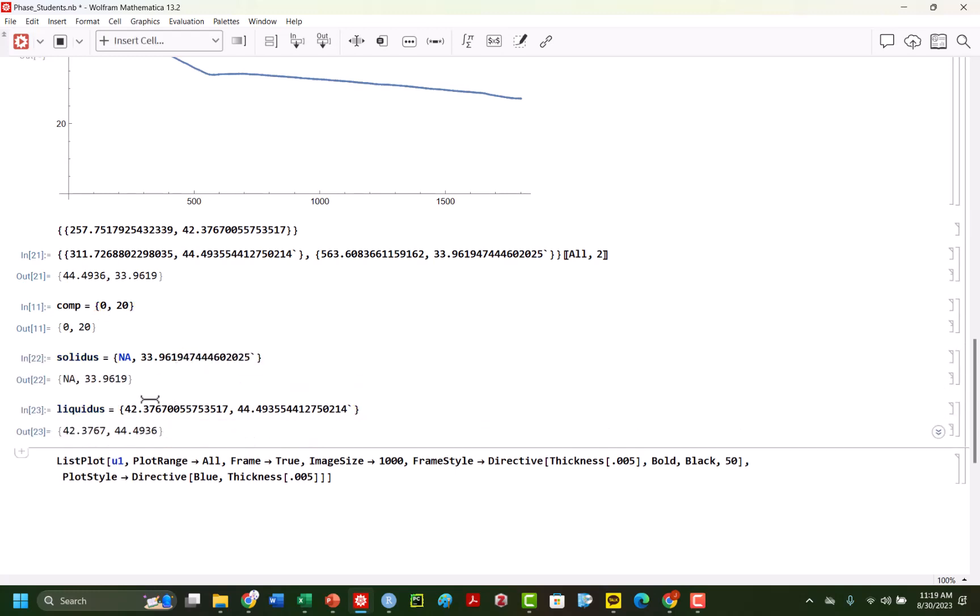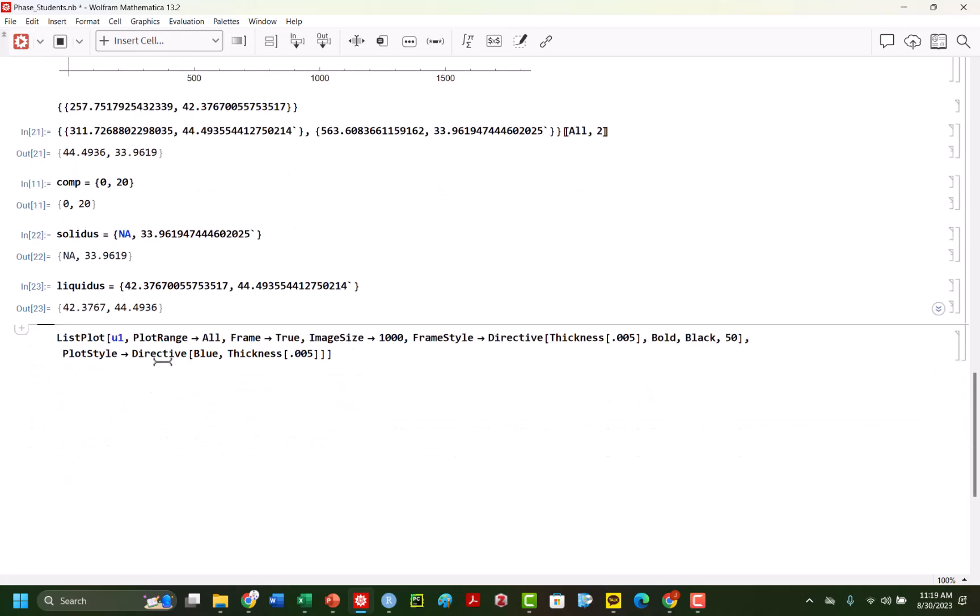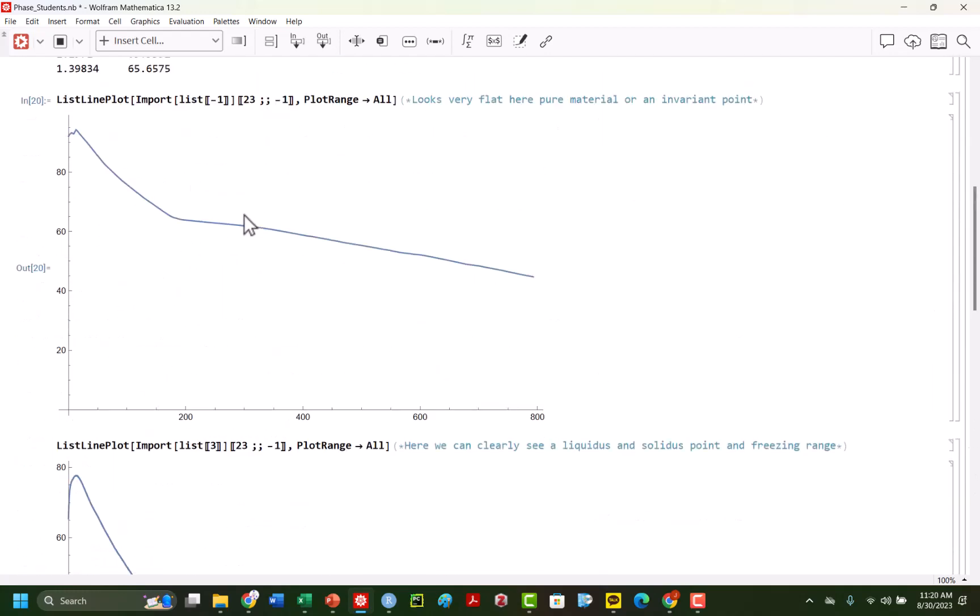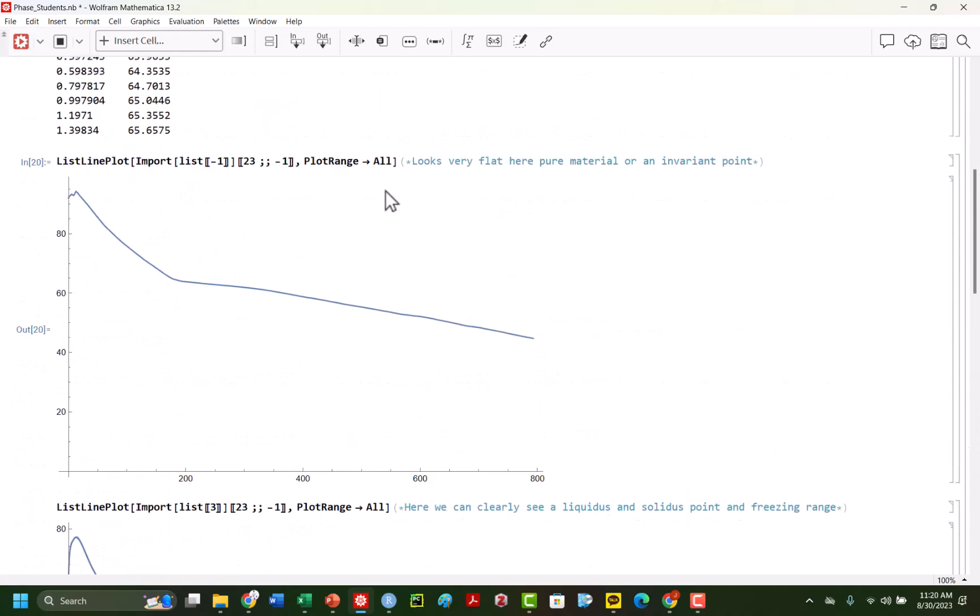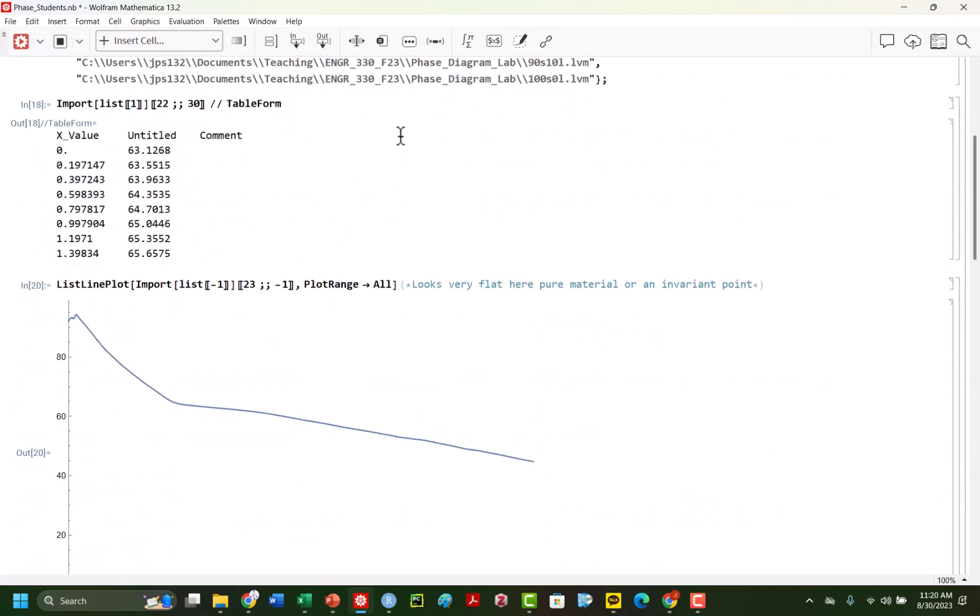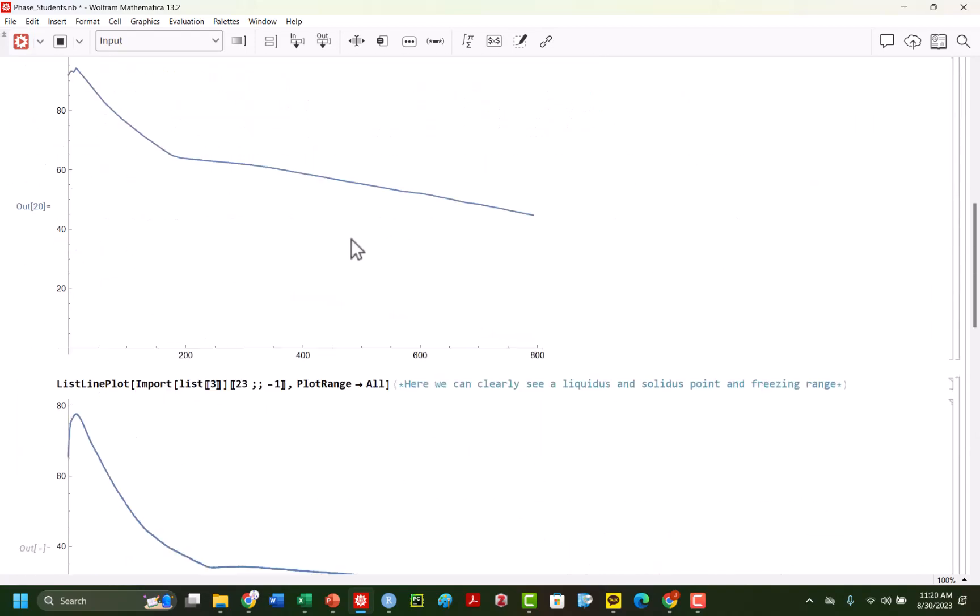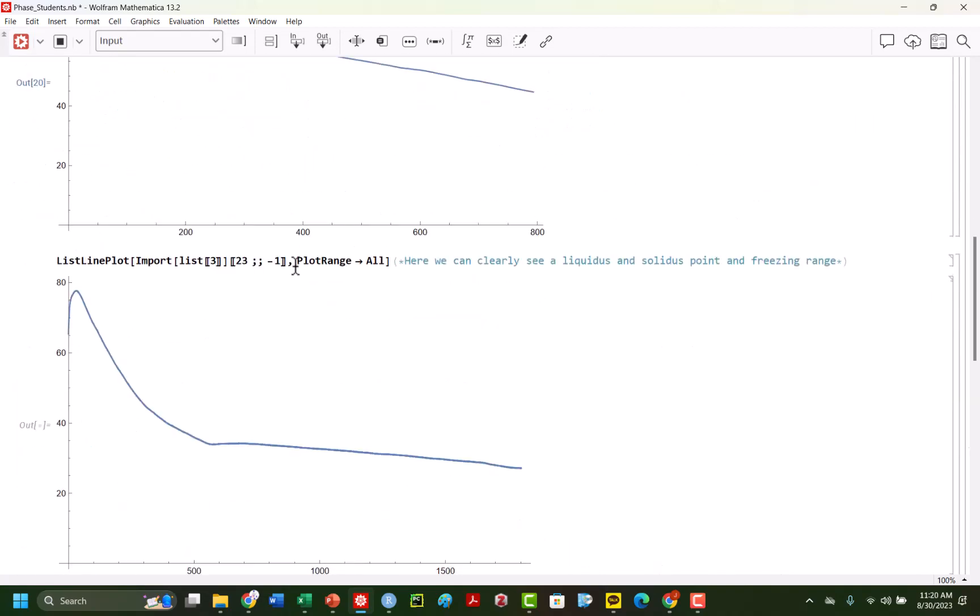we have a solidus, the lower temperature and the liquidus here. So we can do this. And now what I'm going to do, and again, you would do this for every plot here. So it's a lot of work, but I believe in you and you can do it.